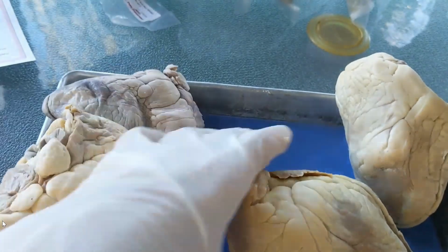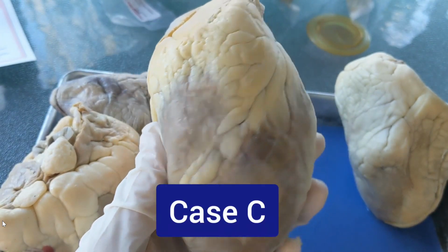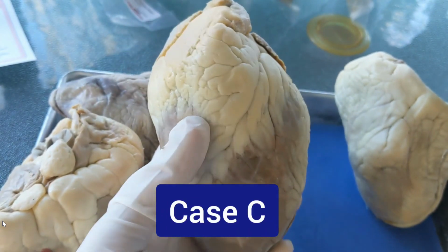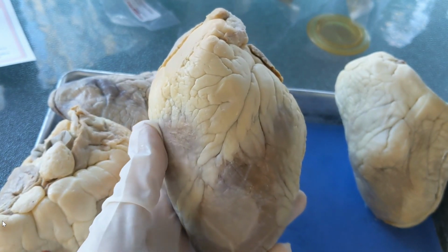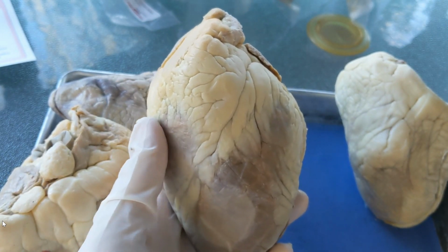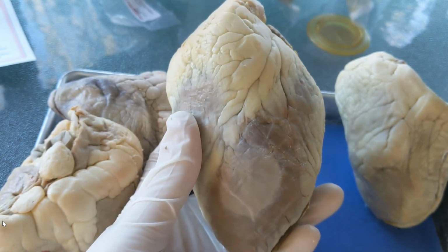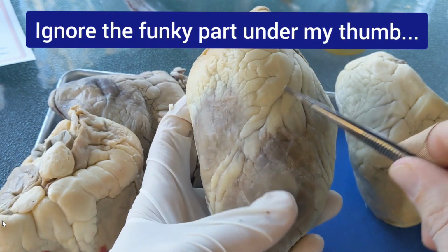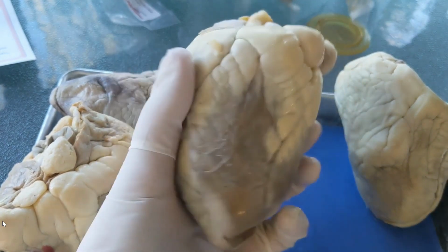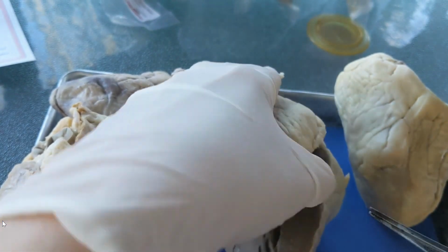Okay, now we are on cardiac case C. Oh, this one's sad. She was only 27 years old. Not that it's not sad if you die when you're older, but recently married, and her skin often had a blue tinge. So now we're looking at her heart externally. Really check out the coronary arteries. And then we're going to do an internal examination.